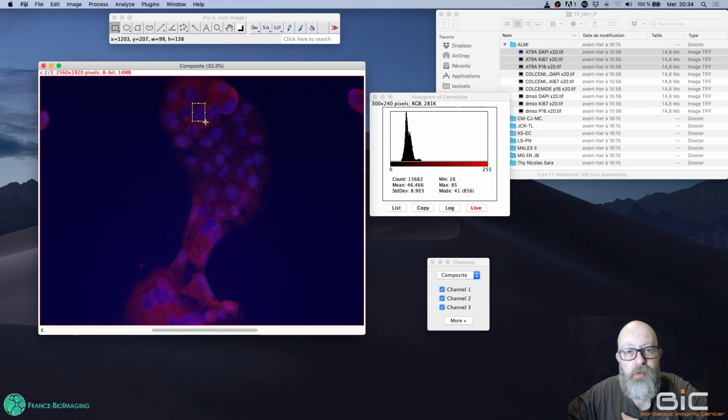Now, if I draw over the signal, I see a bump that is scaled now. To confirm that this is signal and outside it's background, the thing I will do is click inside the region of interest and move the region over the background.